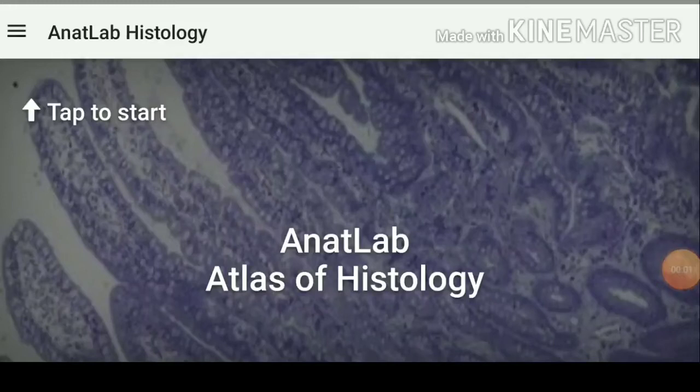Friends, today I'm going to discuss the histology of the thyroid gland. It is a very important application that I found, the anatomy lab or atlas of histology. So if you want to study the histology of different organs, it is a very good application for you to study histology. So today the main focus is on the thyroid gland.